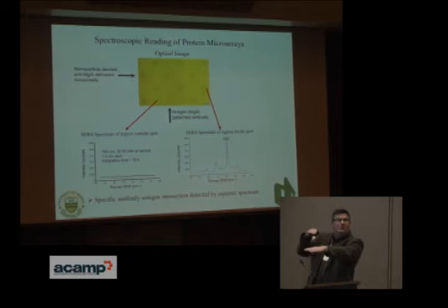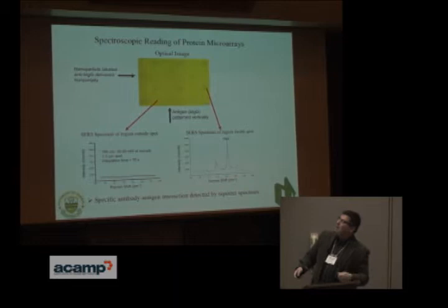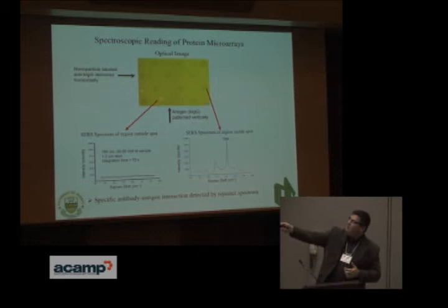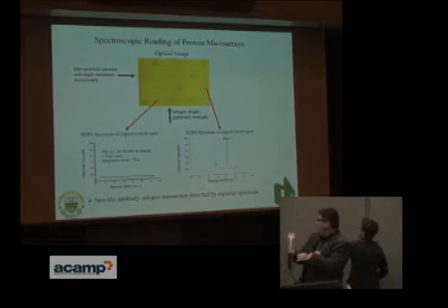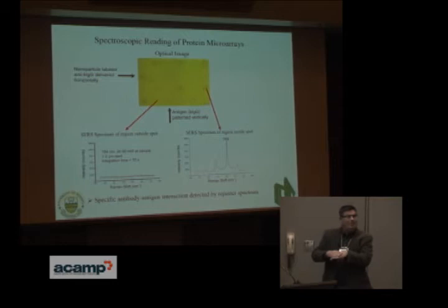And so here's visibly, this is just an optical micrograph where you can see the cross points of our microfluidic channels. If we take a spectrum in between the spots, we don't see anything. If we take a spectrum on the spot, we see the signal from our label. And they're located at this spot simply due to the antibody-antigen interaction. And so our antigens have been labeled with this nanoparticle, and we can use this signal for detection.